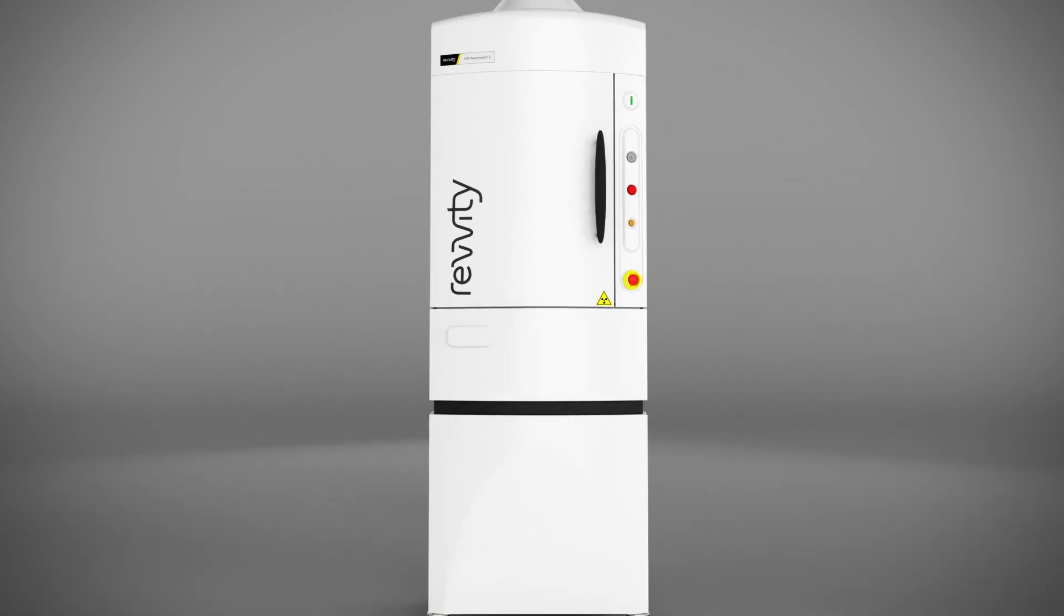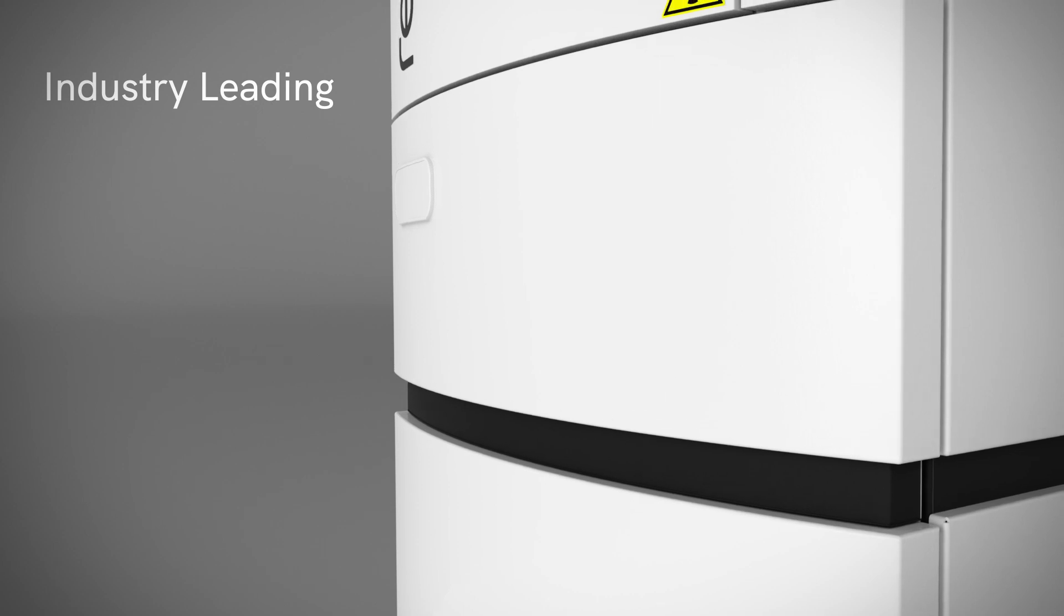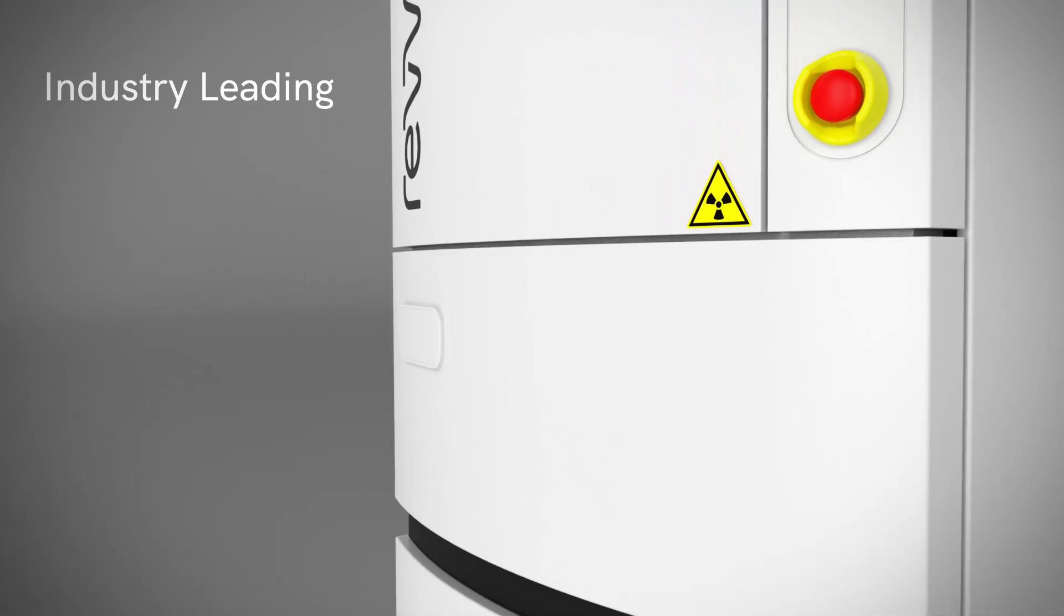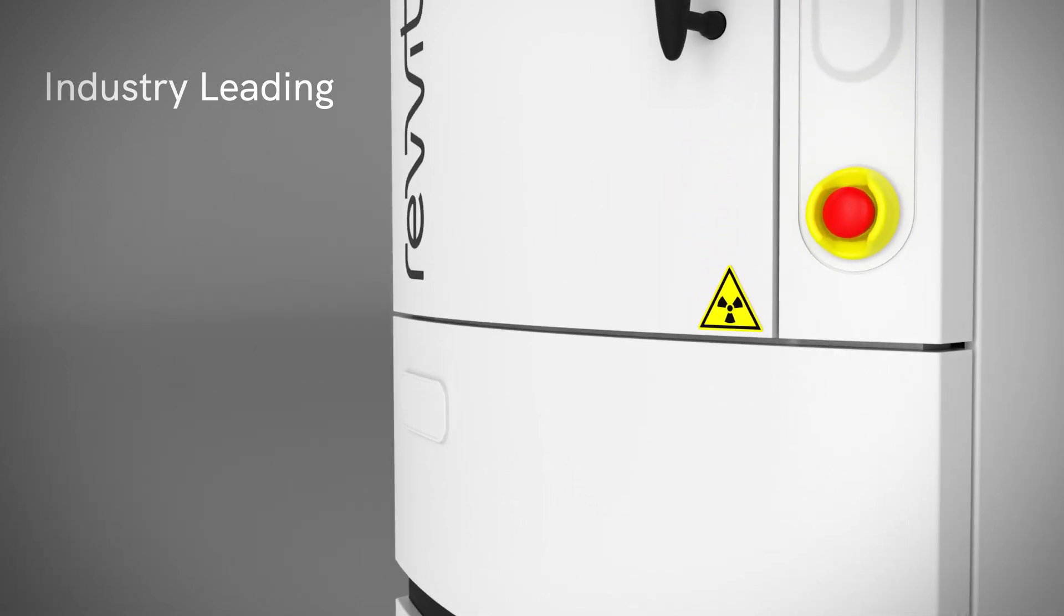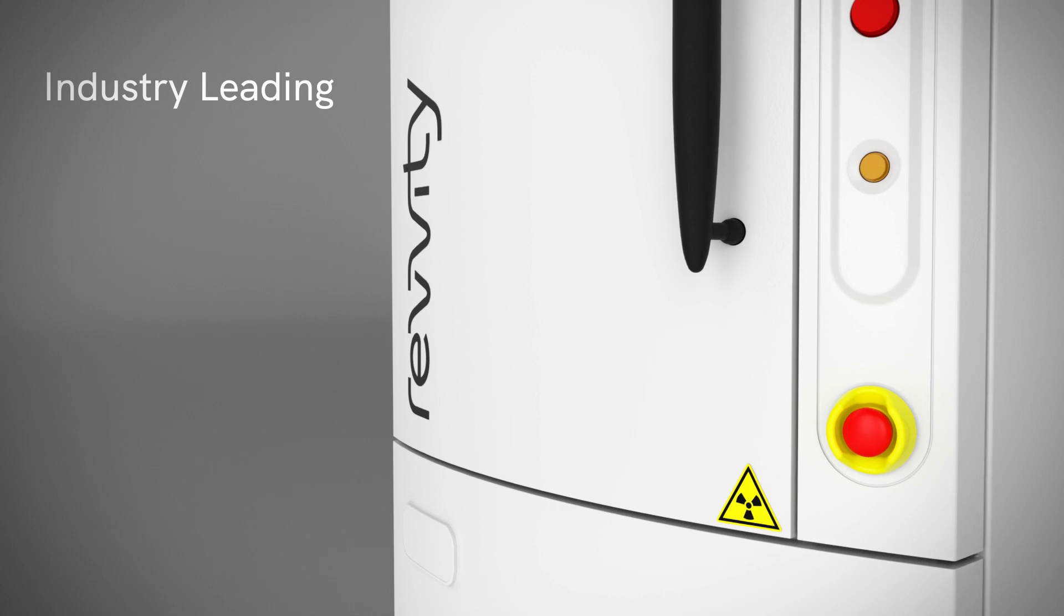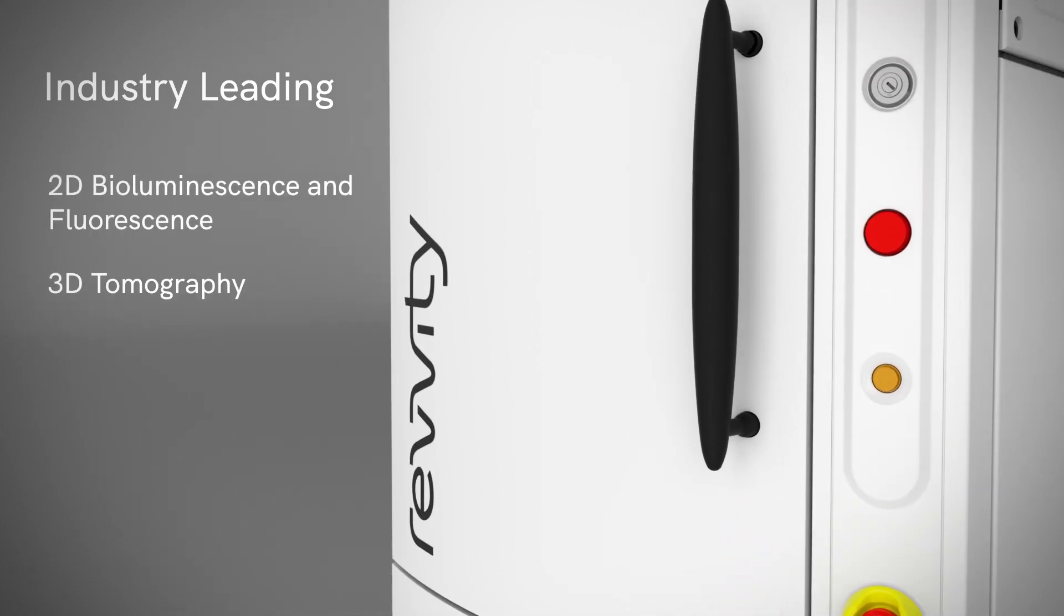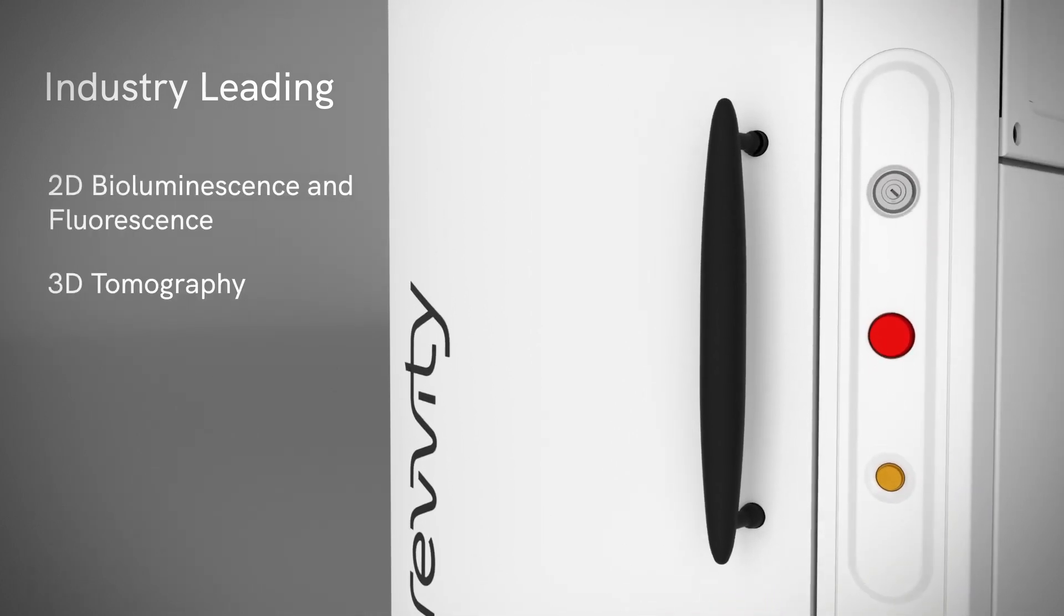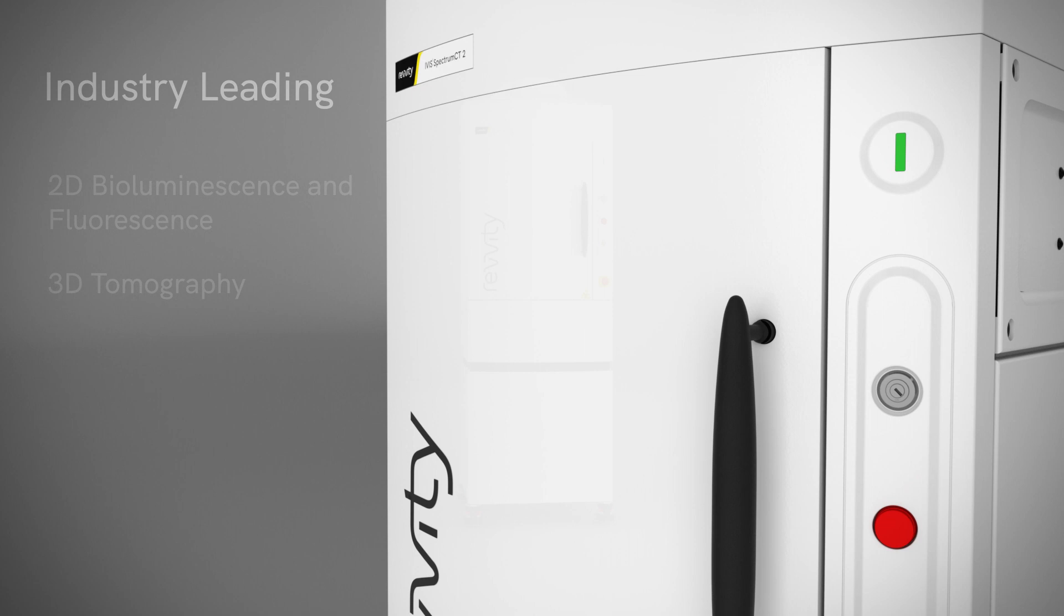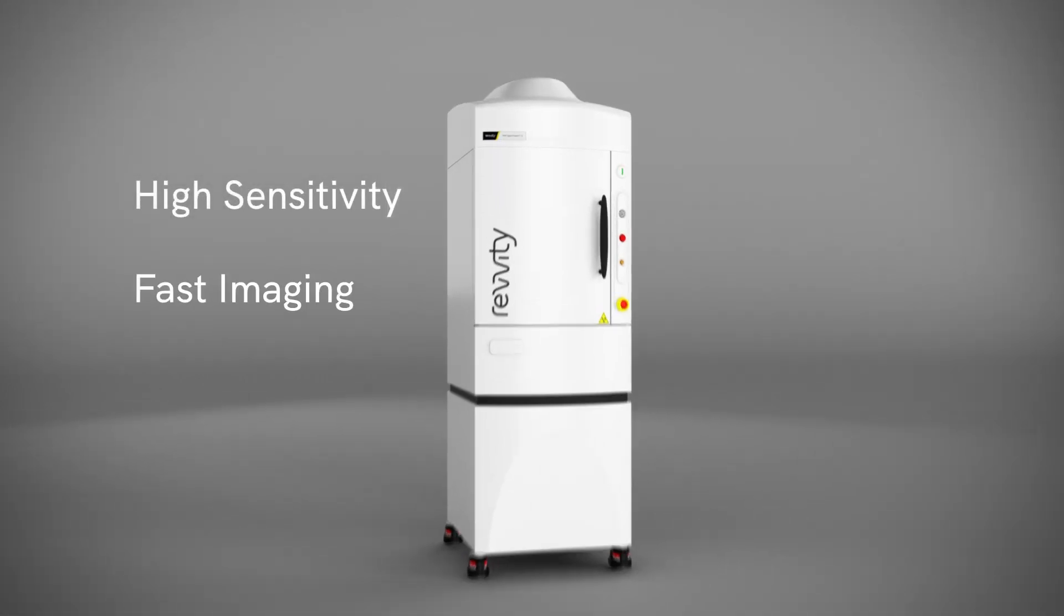Built upon our reputation as the industry leader in optical imaging with our flagship IVIS systems, the IVIS Spectrum 2 series is the ultimate platform for quantitative 2D and 3D bioluminescence and fluorescence imaging, offering high sensitivity and speed.